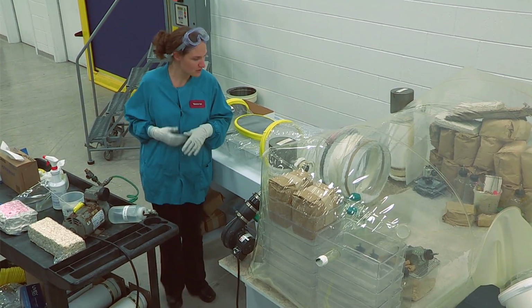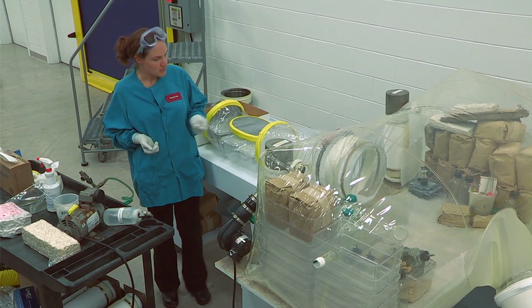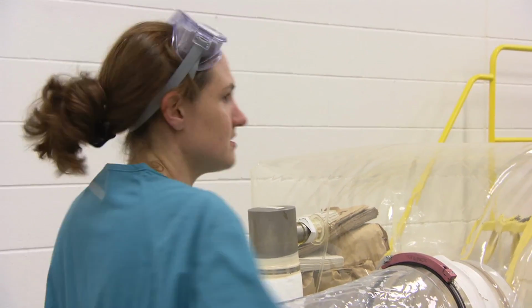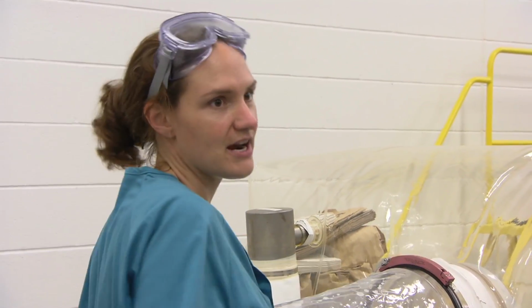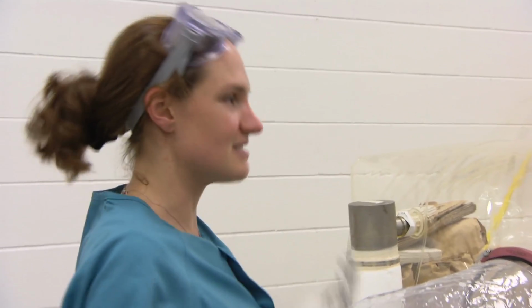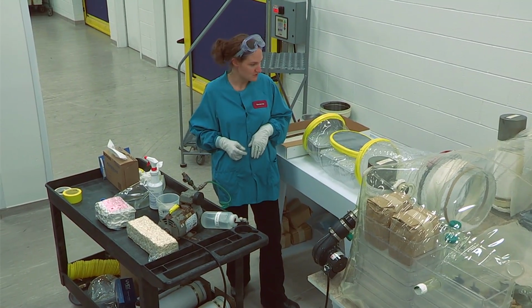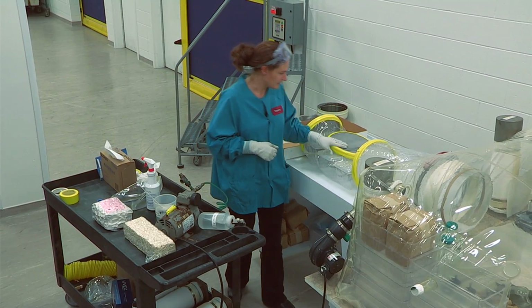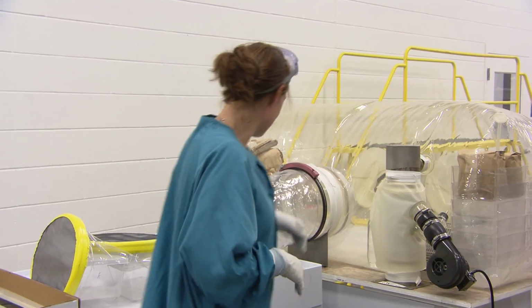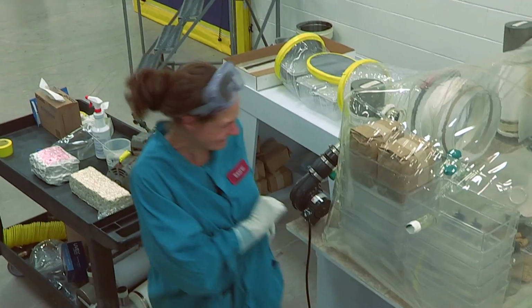Now, I've heard 2 ways of entry of the animals. Some people just burst the Mylar ring with a pair of forceps, while others untape it and take the entire Mylar ring into the isolator. So what we're used to doing, because we're packing them, it gets untaped and the entire Mylar ring comes into the isolator. But yeah, some do pop the ring.